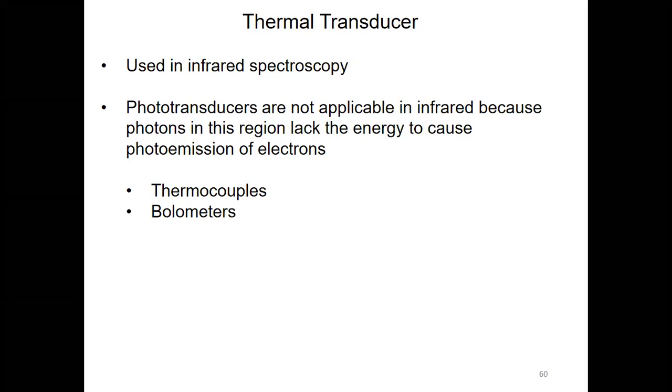So heat is transferred in the thermal transducer, whereas in the photon transducer, light is transformed. And the thermal transducers are highly used in IR spectroscopy.